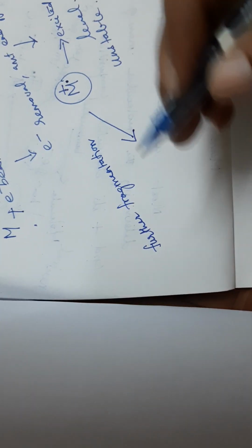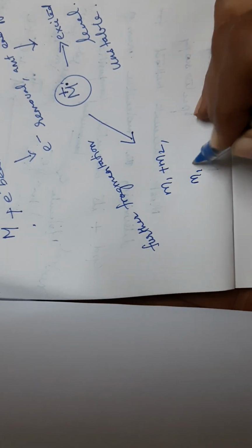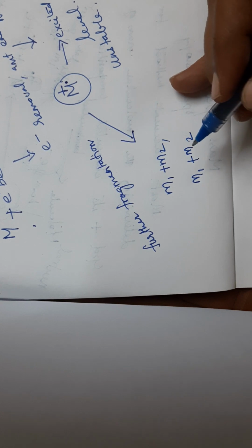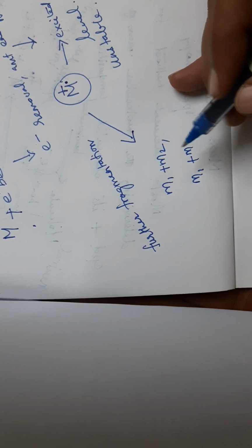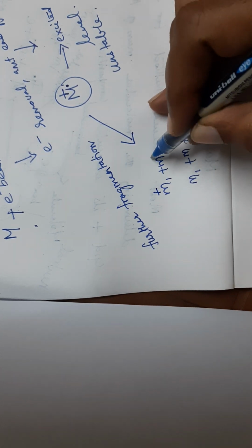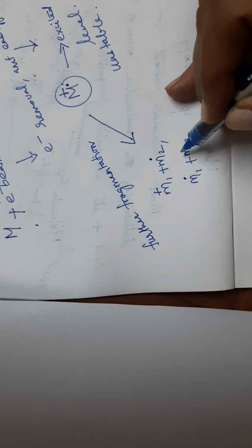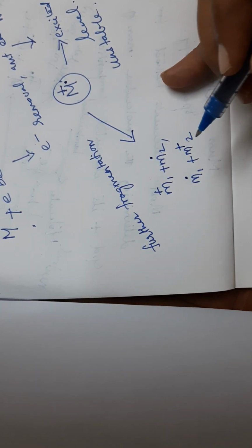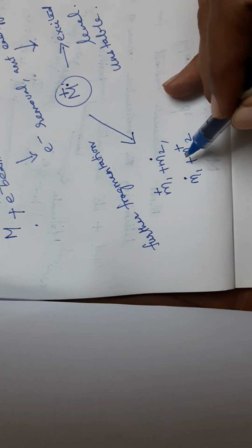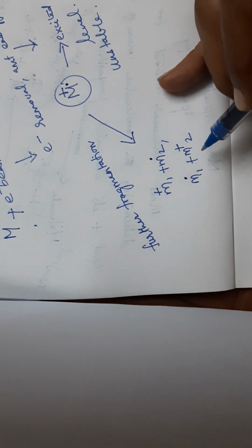So it yields M1 plus M2, in two possible combinations, where M1 carries the positive charge and M2 is the free radical, or M1 is the free radical and M2 carries the positive charge. The charge on the ions formed is +1.